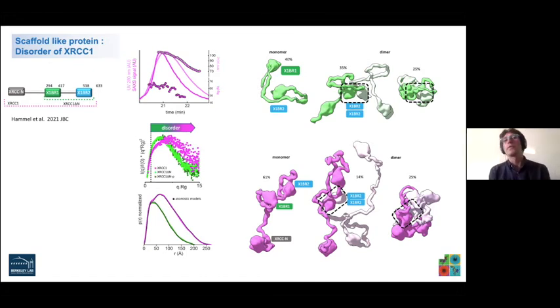We also have, and Somi is going to talk about it tomorrow, I hope she's going to show some failure and success as well. The spike itself is a little bit tricky. You have lots of glycosylation, and separation could be tricky because it aggregates when you put some nanobodies on it. I believe it's not aggregation but some kind of cross-linking, even though you're expecting one nanobody, et cetera.